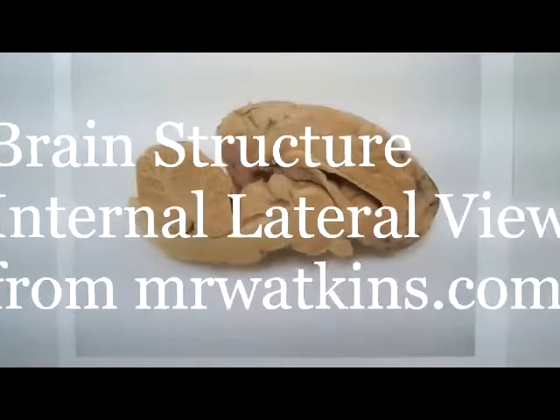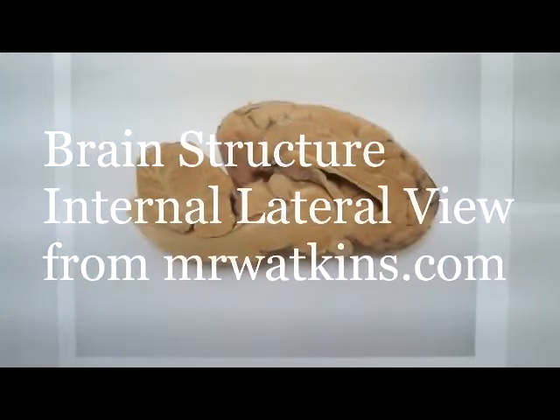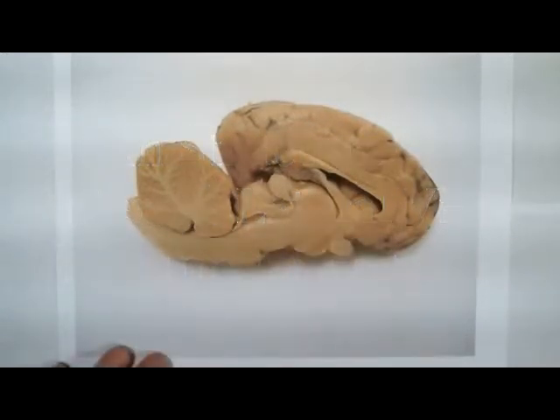I'm Mr. Watkins. We're going to just go through the parts on the sheep brain here. As far as the function of these different parts, that's something you're going to need to look up. But I wanted to go through, at least for the lab, and be able to point out the different parts that you need to be aware of. So let's go ahead and get started here.